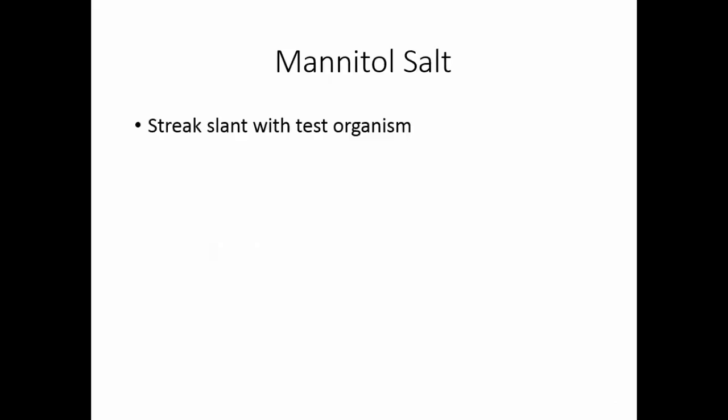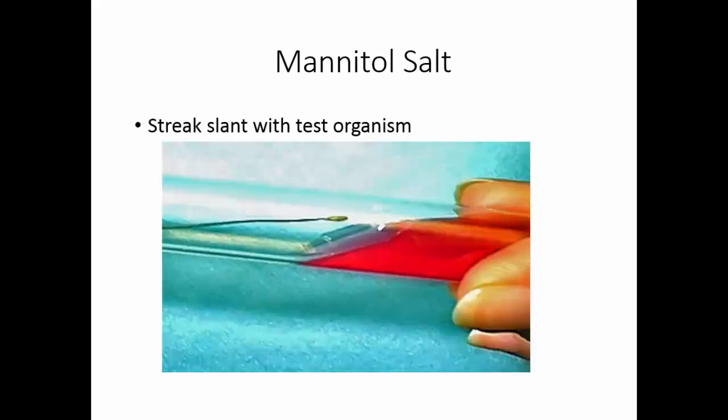Mannitol salt comes as an agar slant, so all you need to do is streak the slant with the test organism and then incubate the slant for 18 to 24 hours at 35 degrees centigrade. The novobiocin susceptibility test is a disc diffusion test.